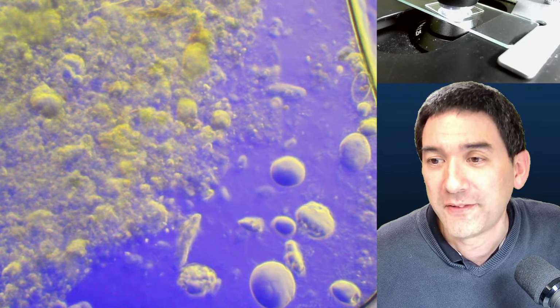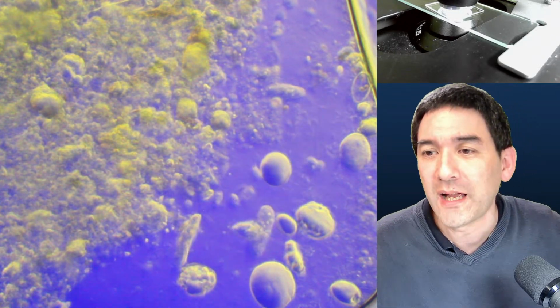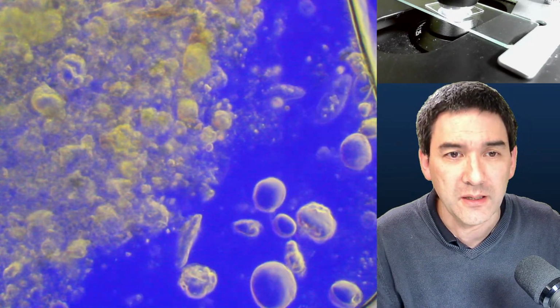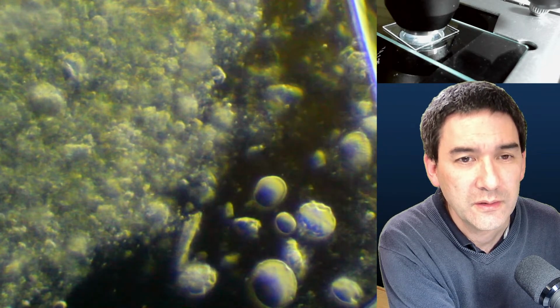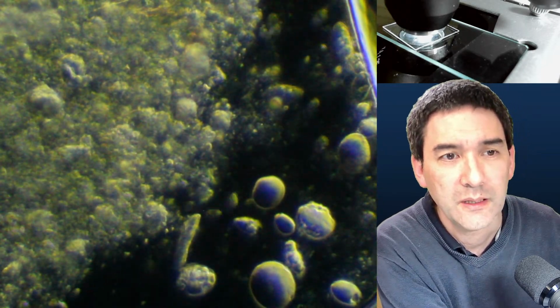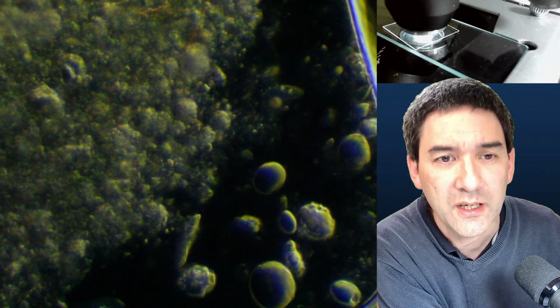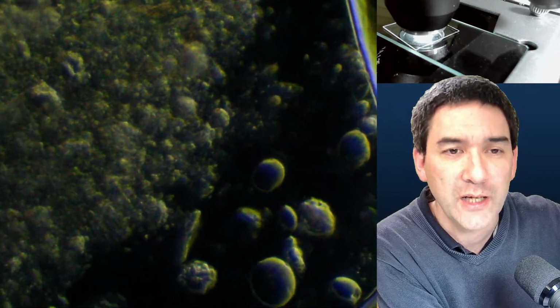So it's been a long time since we looked at the water specimens. But maybe most of the time you can see it better in dark field. Yeah, we can try this as well. So this is now with Rheinberg, and now I'm going to exchange it, completely take it out, put in a dark field filter, and this is how it looks in dark field. Again, here you see, because this filter is a little bit off center, those bubbles appear to be casting a shadow a little bit.